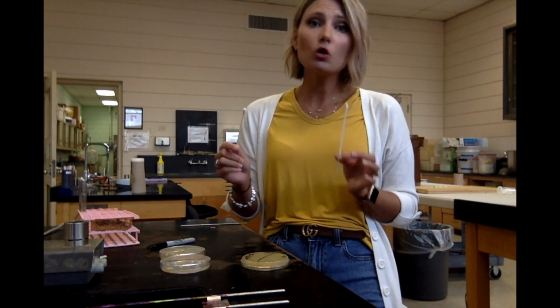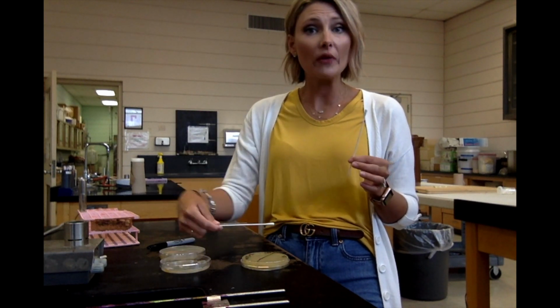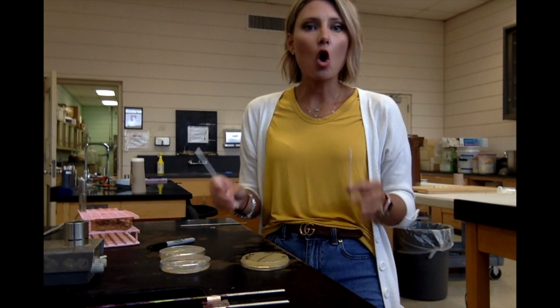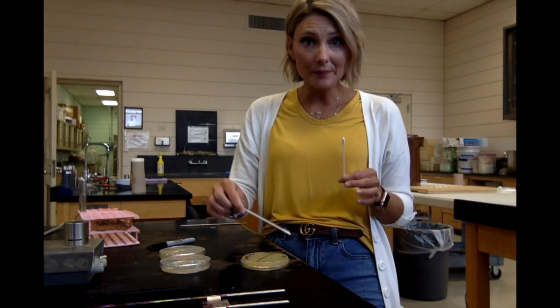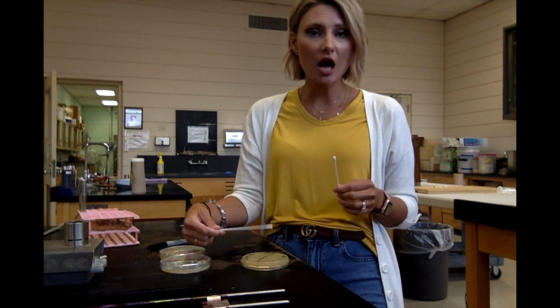And so basically all you're going to do is swab the area and then streak it back and forth on the media, on the plate. Now remember, the media is like hard jello, so you don't want to stab. The bacteria are going to grow on top of the agar, on top of the media.